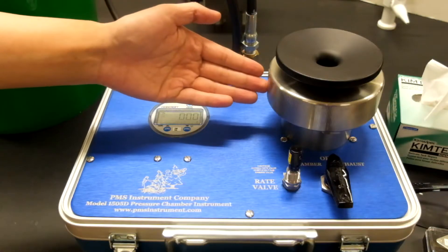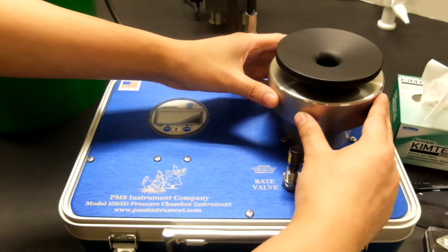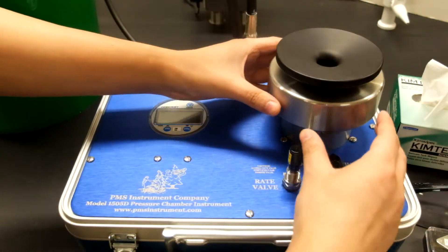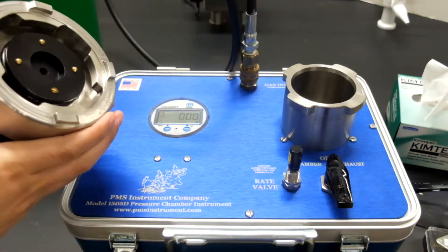Over on the right is the chamber where the leaf can go into. We have the metal lid with the black gasket on top. The lid can lift right up to expose the chamber and the leaf will fit in.